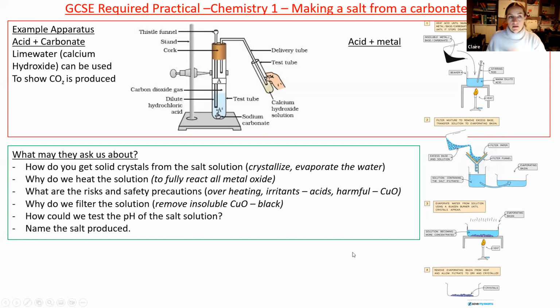And don't forget about the equations. You might have to write out the equation and what the products are. So remember, hydrogen, water, or carbon dioxide are the other products. Okay.